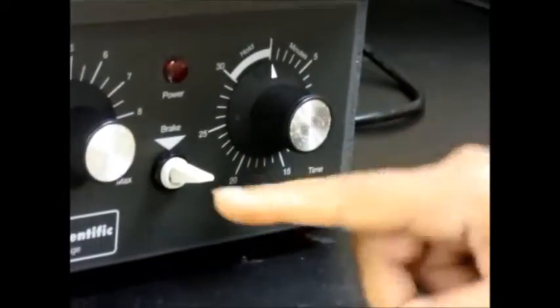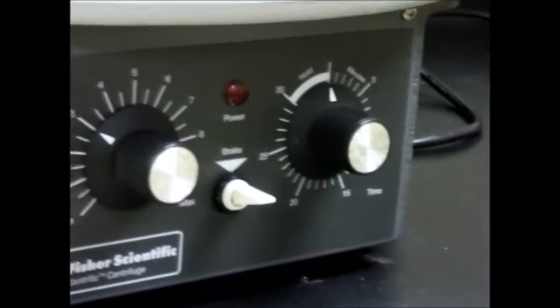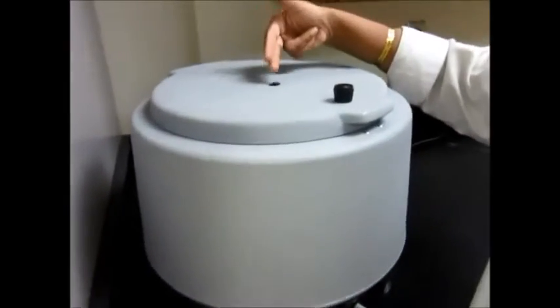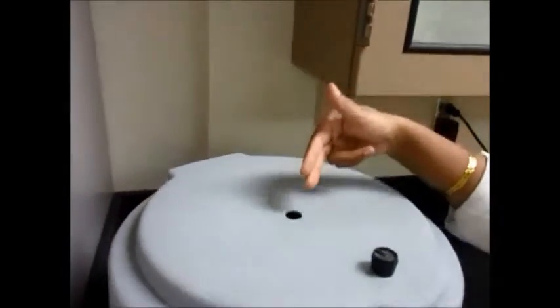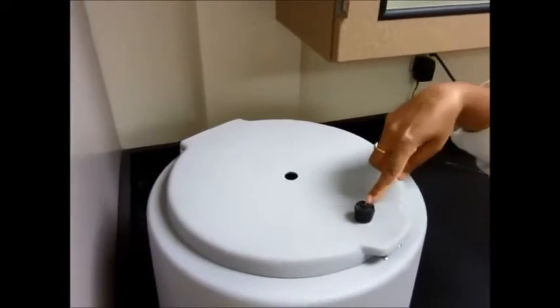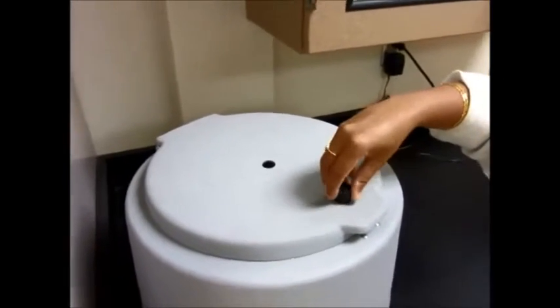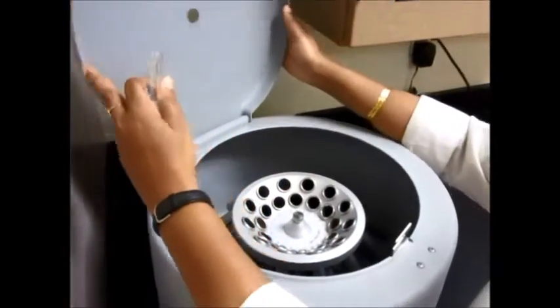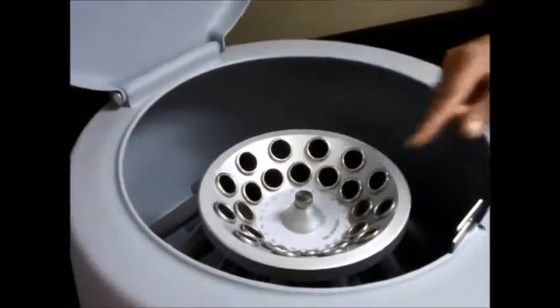Let me show you the inside of a centrifuge. You can see there is a hole in here so that you can actually see inside to check if the spinning has stopped or not. And here is the little latch that you need in order to open up the centrifuge. This is what a centrifuge looks like.